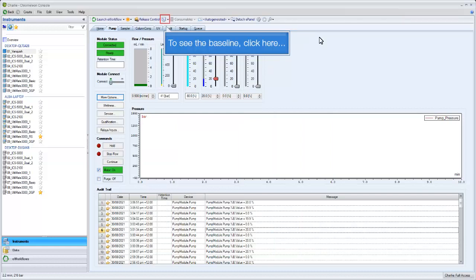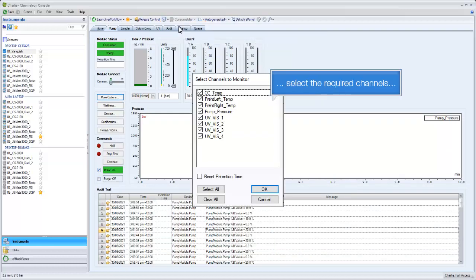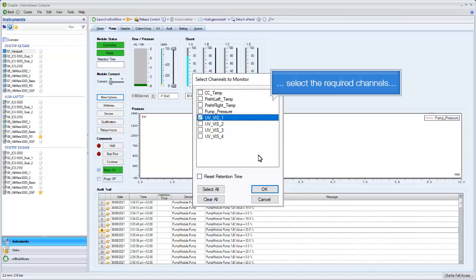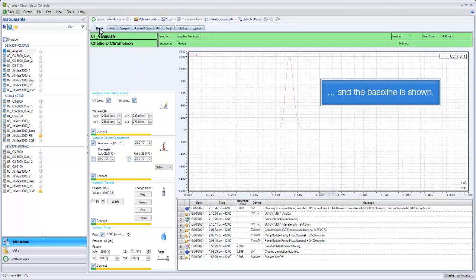To see the baseline, click here. Monitor baseline. Select the required channels, and the baseline is shown.